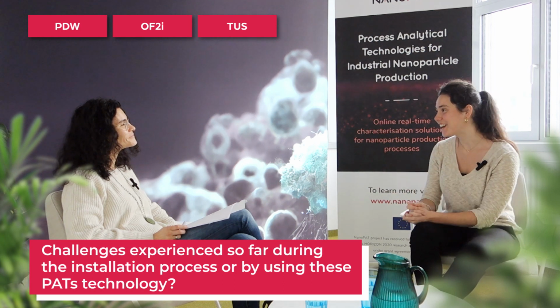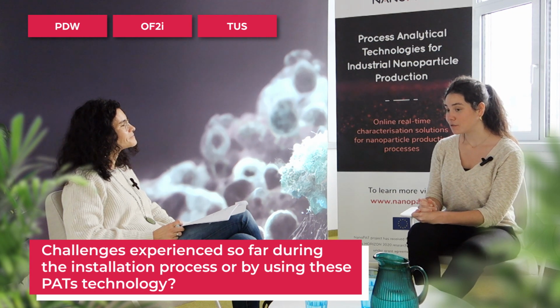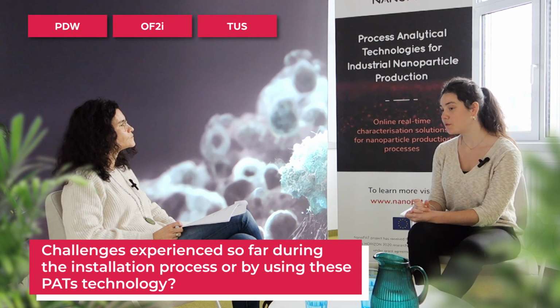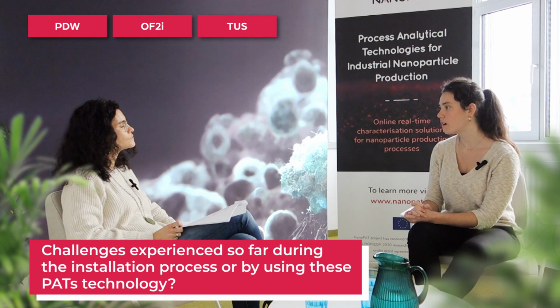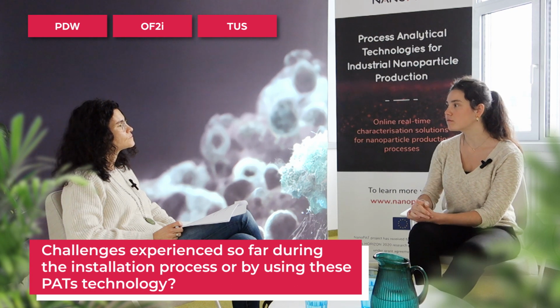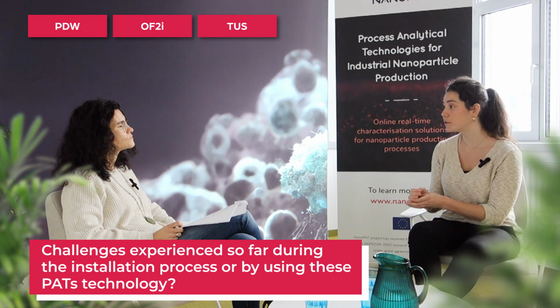And going a bit now into the challenges that you have asked, I will say that there is a challenge that is still remaining in the three of the techniques, that is the problem of being able to measure the particle size for very small particles. With the three of them, we were able to at least see the particles or detect that we were having something in the dispersion for particle sizes bigger than 100 nanometers, but going to lower particle sizes, at least with the polyacrylate polymers, it's really challenging. This is also something very system dependent. It depends on the refractive index of the material, but for the polyacrylate case, it was very challenging.